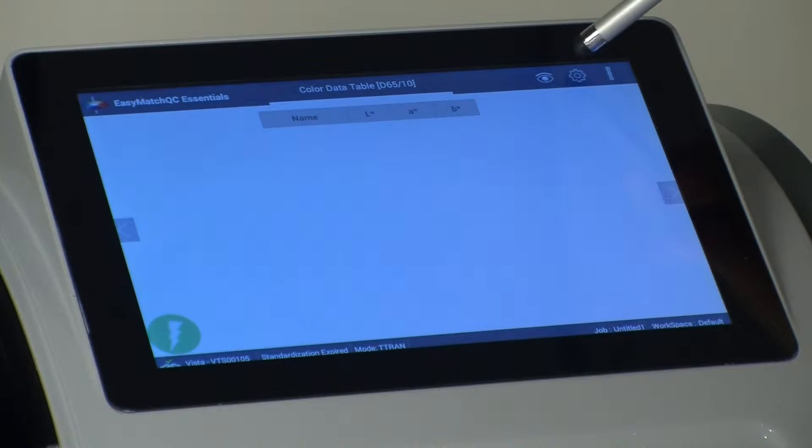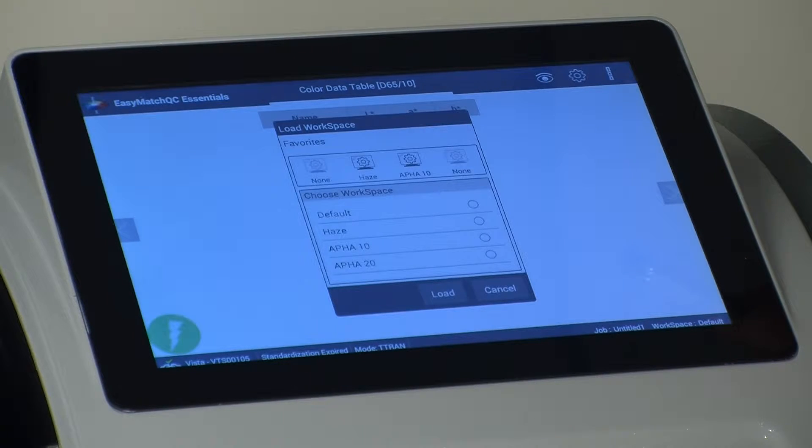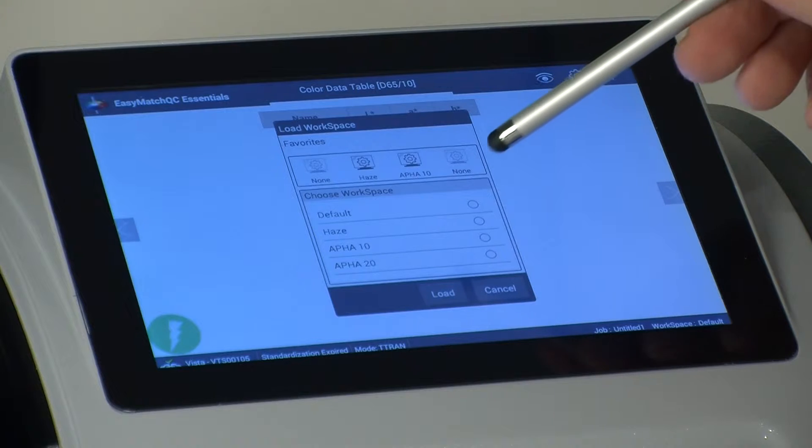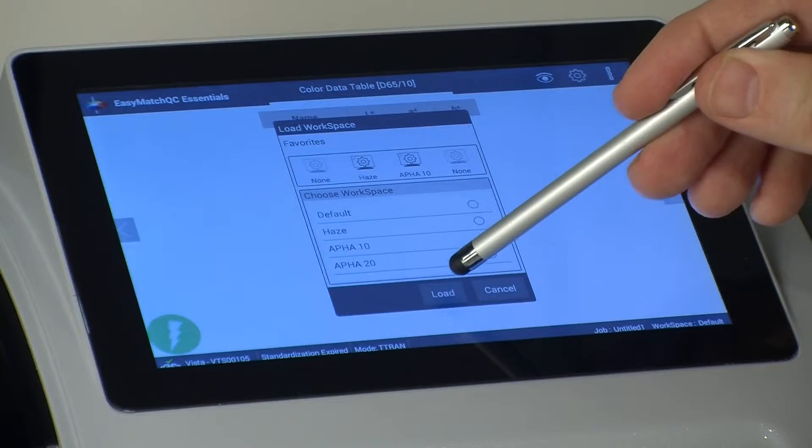From the Workspace Settings icon, select Load Workspace. Select the workspace corresponding to the path link that you're using and then press Load.